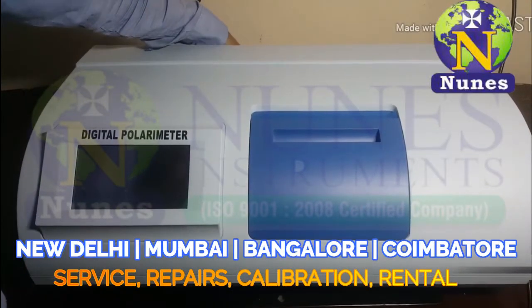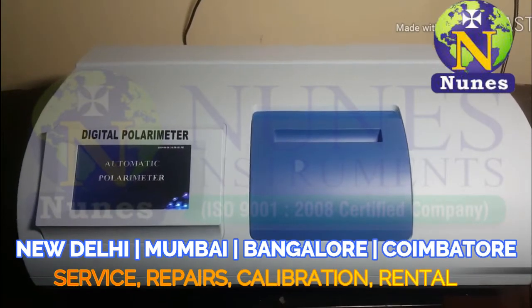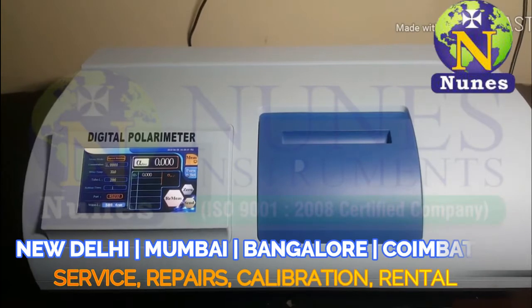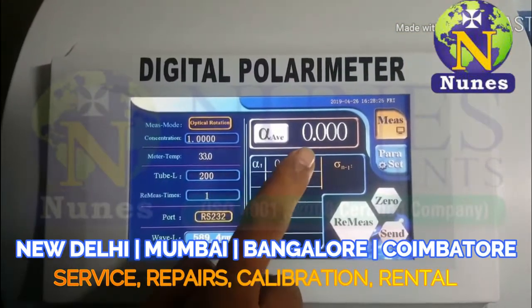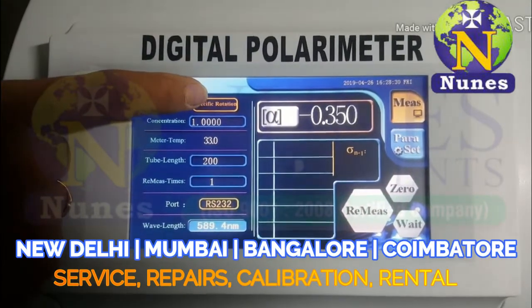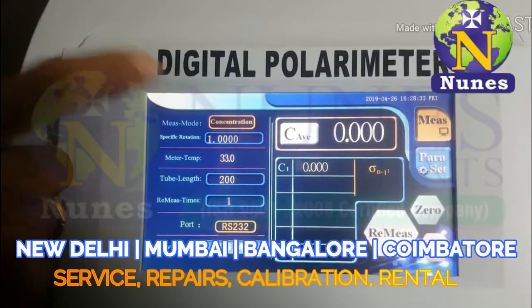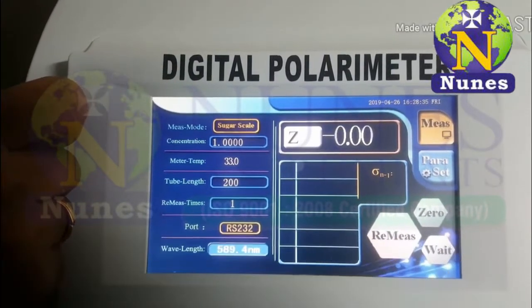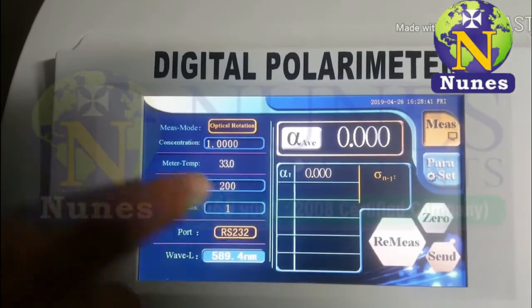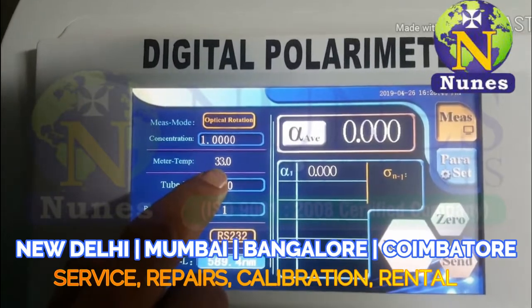Power on the instrument. Now showing measuring mode: zero point triple zero. We select mode on the touchscreen — concentration, sugar scale, optical rotation. Now we select optical rotation. This is the instrument temperature display.